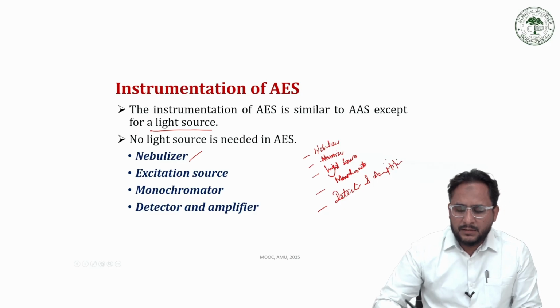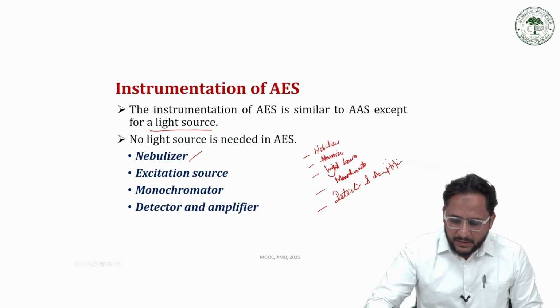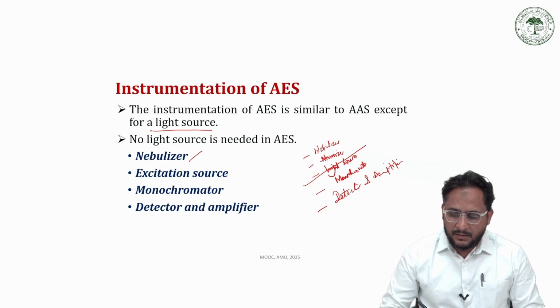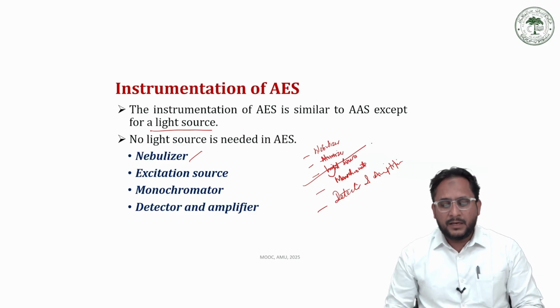But in this case we do not need a light source, so I strike out this light source.